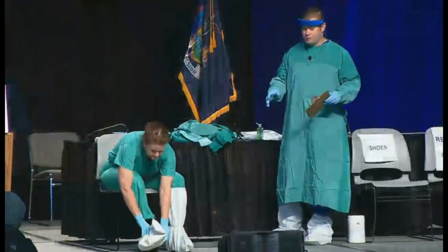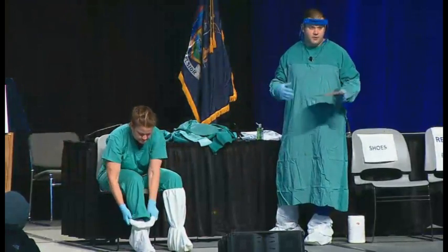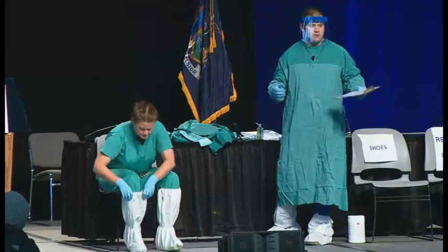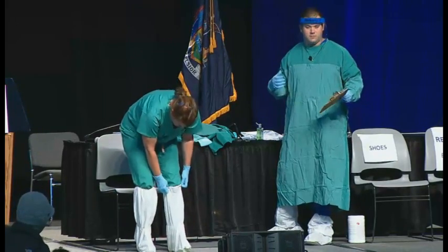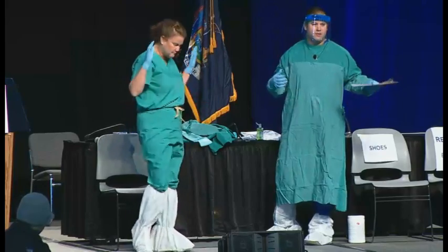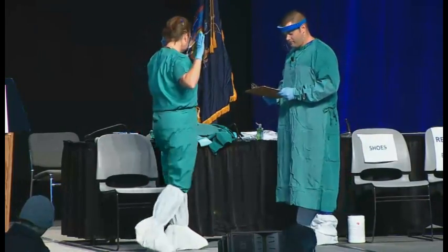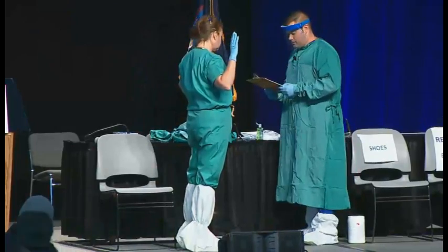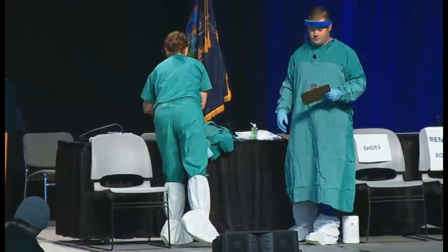One thing I want to mention with the shoe covers, the gown, and even your gloves — you want to make sure everything fits. That can be a problem if you have the wrong size, so you really want to check and practice, and that's why you want to practice it so you know the sizing as well. Barbara's now going to put on the gown and make sure that the inner gloves are tucked under the sleeves of the gown.